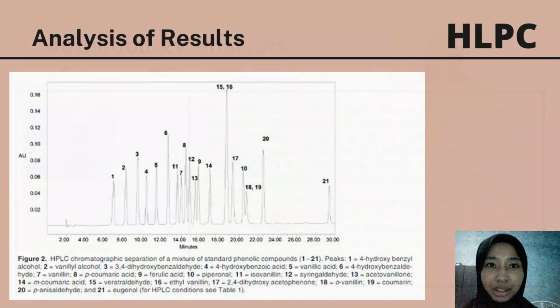In this experiment, we attempted to use a combination of acetonitrile with methanol at a 1:1 volume ratio and 0.2% acetic acid. It proved successful as it allowed the separation of a maximum of 21 standard phenolic compounds, even though we ran more than 25 phenolic compounds as reported in various species of vanilla.